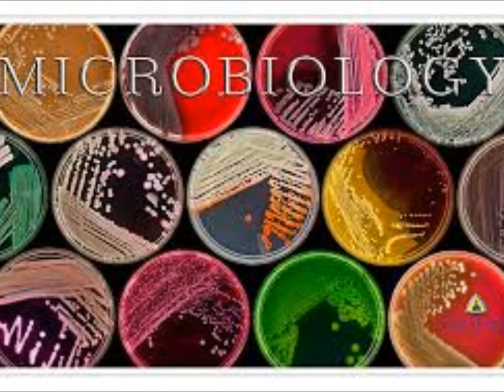And alpha hemolysis is an incomplete lysing of the red blood cells. And in that incomplete lysing, what happens is the colony forms a green area around the colony. So it's partially lysed the blood cells, but hasn't completely lysed it to the point where it's clear. So you end up having this green look to it.